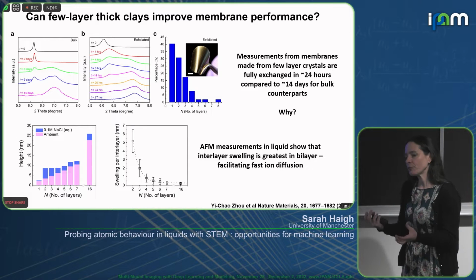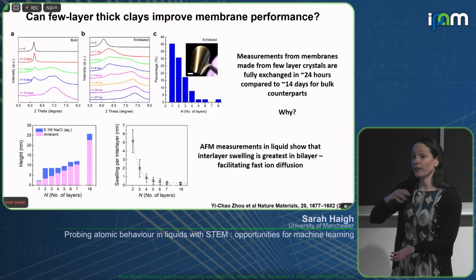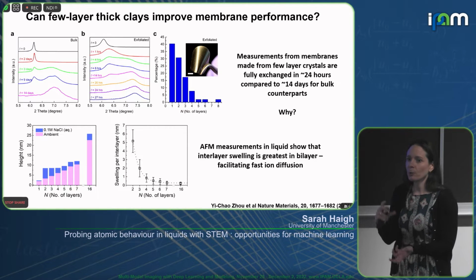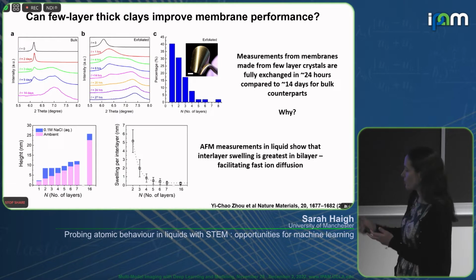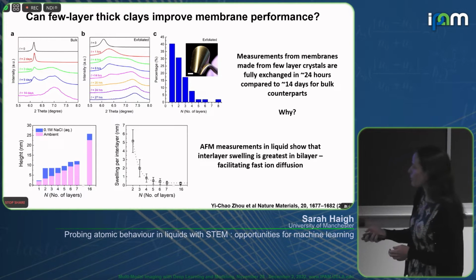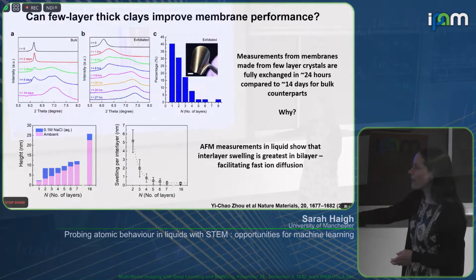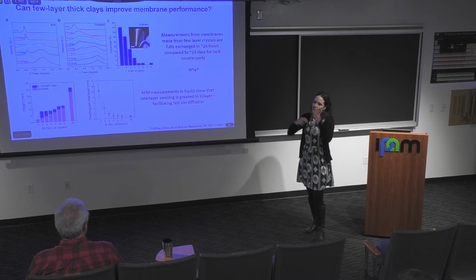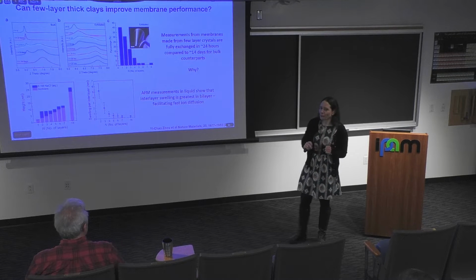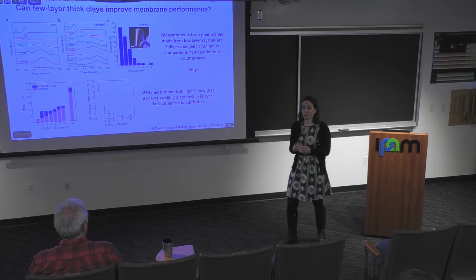So there's a massive difference in the ability of that crystal to swell the interlayer space when you have a very small number of layers. And that's due to the potentials interactions, which was modelling done by Francois Peter's group in Antwerp. So you can see this swelling is very heavily dependent on the number of layers, and that effectively means that this 5 nanometer space, and this is going to become important later, this 5 nanometer space, the ions behave as if they were in free water.